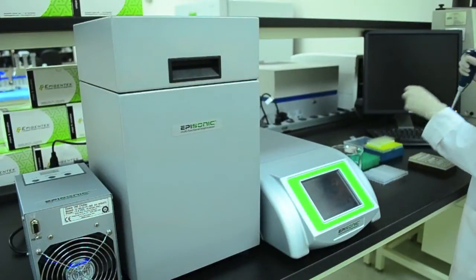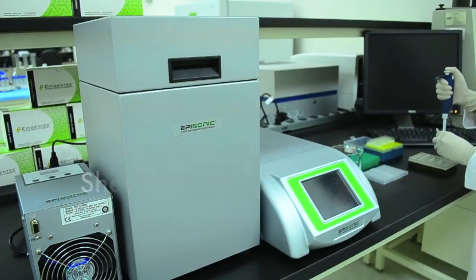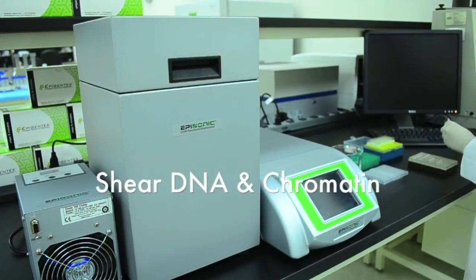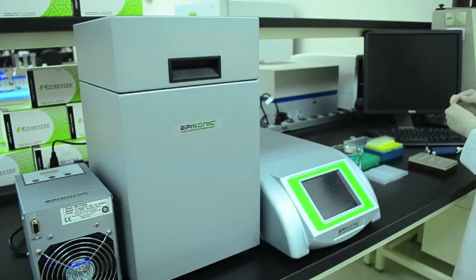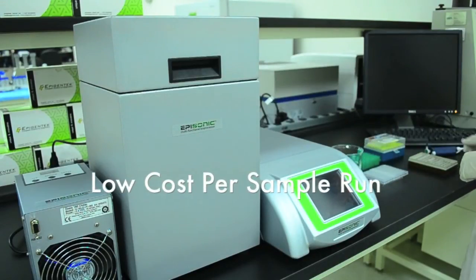The Episonic 1100 is a high-throughput ultrasonic processor for DNA shearing and chromatin shearing as well as cell lysis. It is designed for ideal sonication performance while remaining extremely cost-effective.